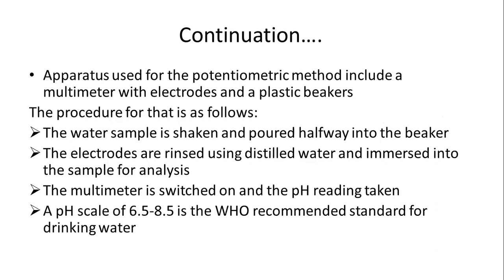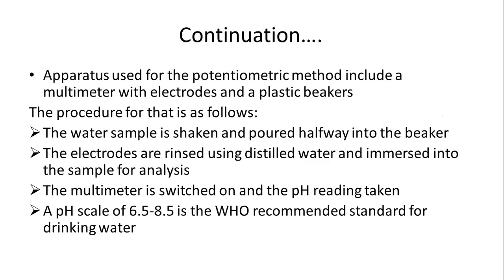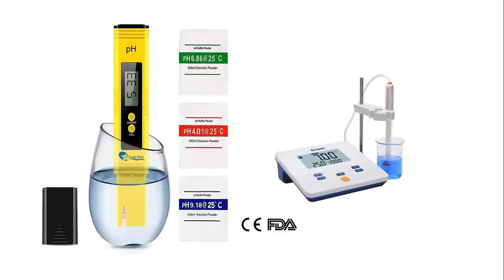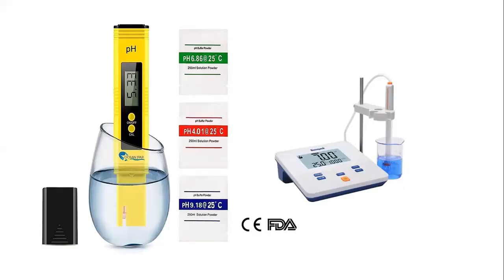I'll move on to the potentiometric method of pH analysis. Yeah, so for this one, we're going to need a multimeter.